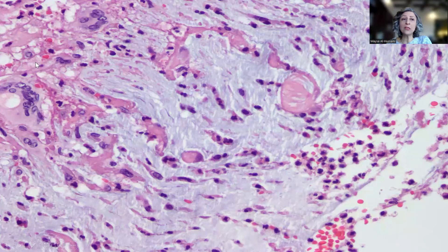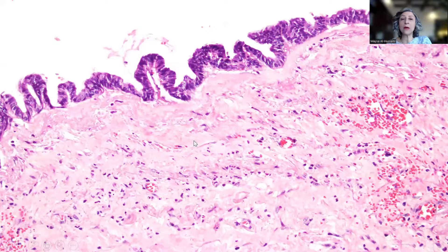as you can see, multi-nucleated giant cells in reaction to the mucin, and then lakes or pools of mucin identified.